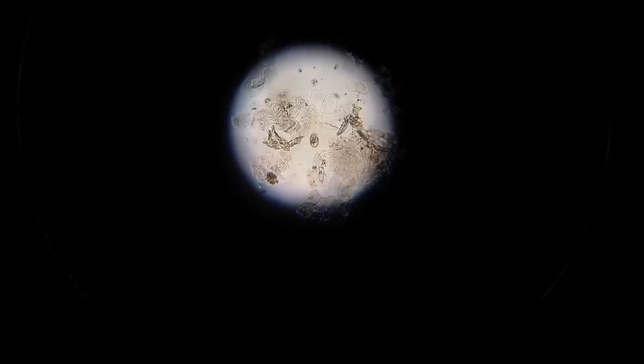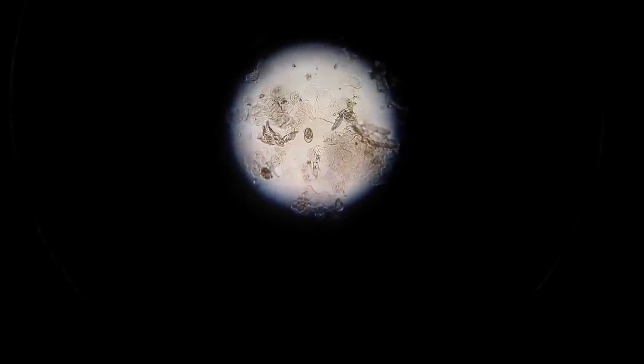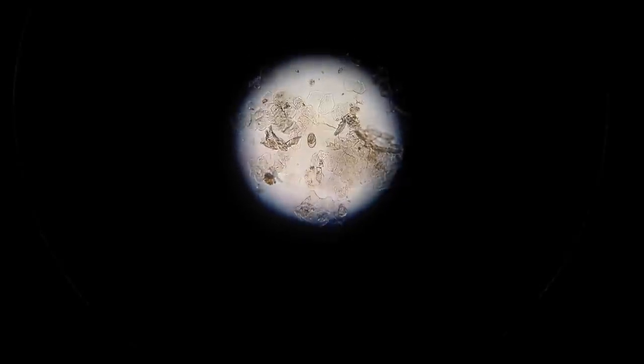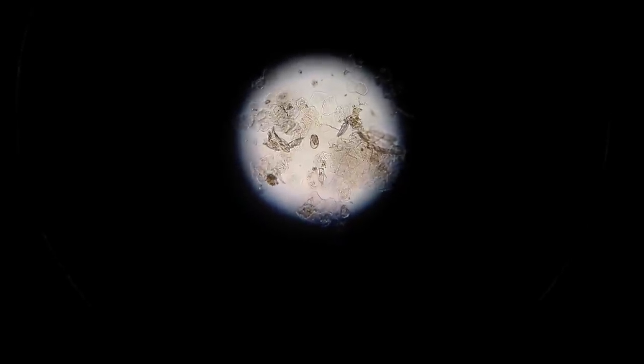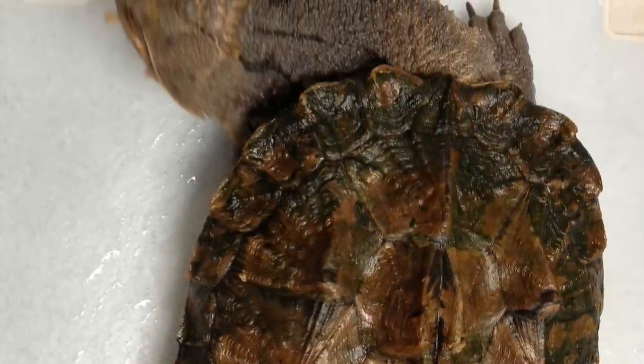This is a strongyle egg from a Matamata, found through the fecal exam. Not Mata Mata, but Matamata. That strongyle egg, you can actually see the live strongyle inside of it moving around. It's kind of moving slowly, so you have to concentrate on it. I hope this focus is enough where you can see it. But other than that, never mind the peanut gallery.